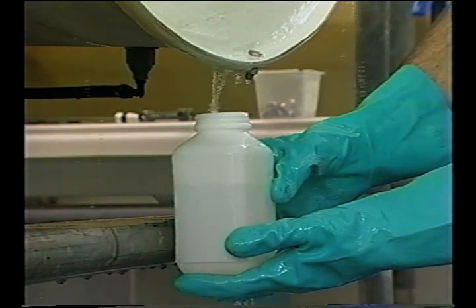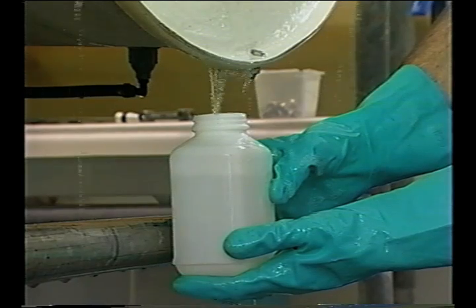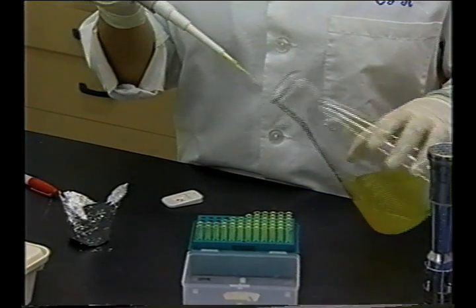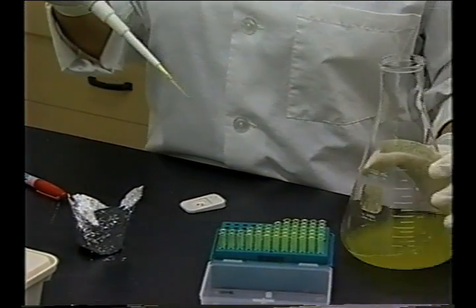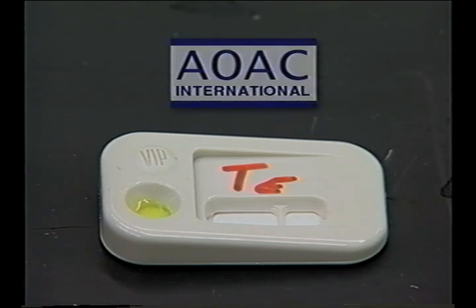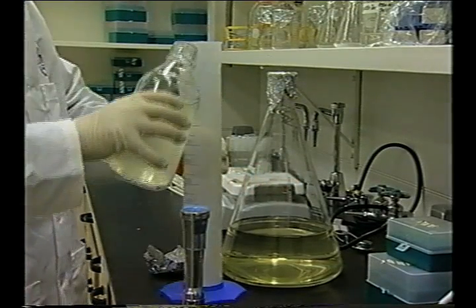Recommended sampling and testing procedures are described in more detail in the FDA guidance document, Sampling and Microbial Testing of Spent Irrigation Water During Sprout Production, which is included in the written material supporting this video. The procedures were chosen to obtain results as simply and quickly as possible and provide evidence for the presence or absence of Salmonella and E. coli O157:H7. The test kits identified in the FDA guidance document are approved by the Association of Official Analytical Chemists International as screening tests or have been used in the past by FDA.